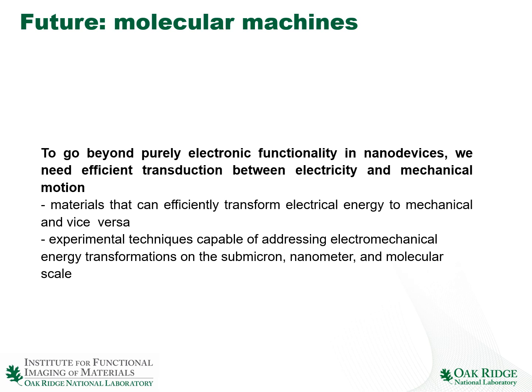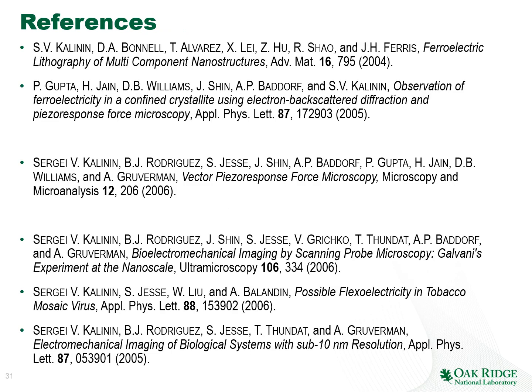In other words, we need to efficiently transduce electricity and mechanical motion. For that, we need materials that can efficiently transform electrical energy to mechanical and vice versa. And this can be molecular machines, biological systems, and so on. But we also need experimental techniques that are capable of addressing electromechanical energy transformations on the submicron, nanometer, and molecular scale. And PFM is such a technique, and I hope that you are going to enjoy the content of the forthcoming lectures that talk about its mechanism, dynamics, and applications.